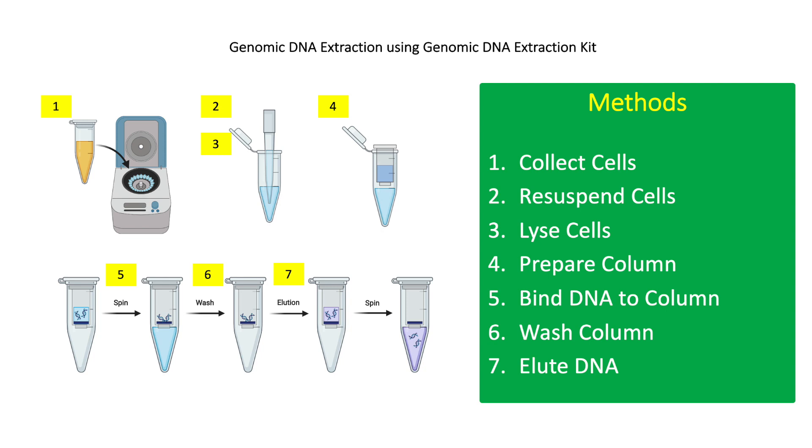For step 1, collect 1.5 ml of bacterial broth culture in microcentrifuge tubes and centrifuge at 12,000 g for 2 minutes. After centrifugation, discard the supernatant.